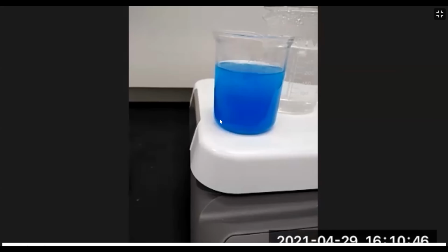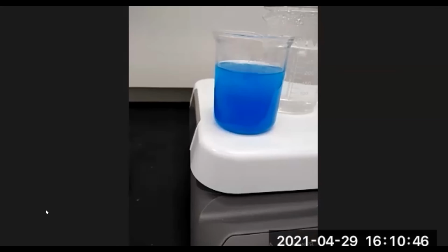So next we want to place it on the hot plate, and I've time-lapsed this, so it takes a little while. You want to see the blue precipitate turn to a black precipitate. Once all the blue precipitate has turned to black precipitate, this is step 3, the decomposition reaction.